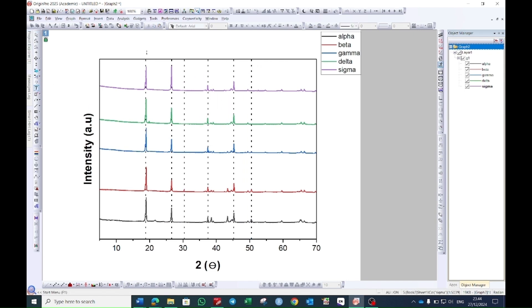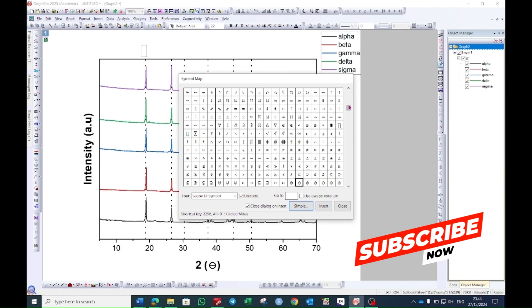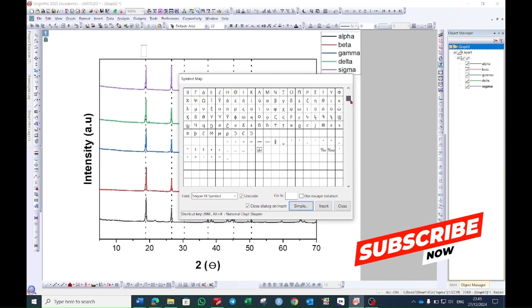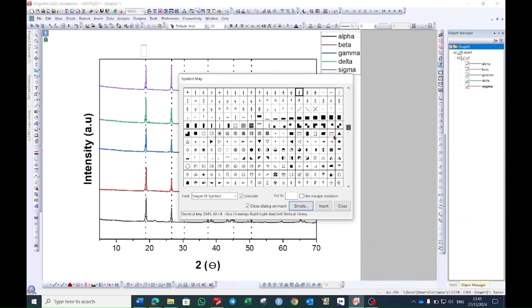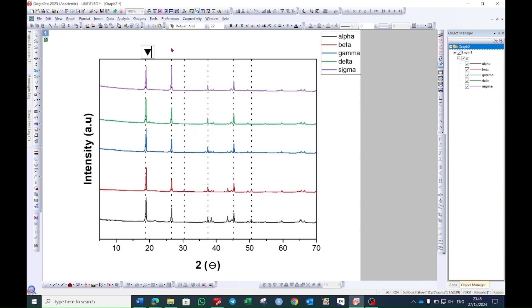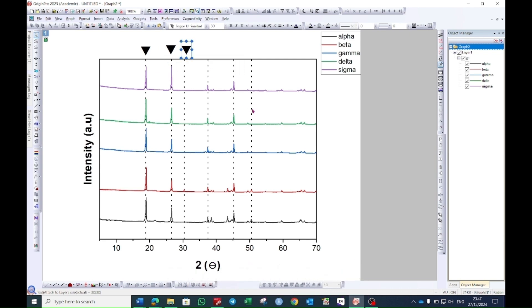Now go to the Text option and bring the cursor to the top of the line. Right-click, go to Insert, and go to Symbol Map again. Here go to Advanced Options — you have a number of different symbols which you can display. Choose whatever you want; I will choose a few of them. Select the sample and increase the size to 30 from this window.